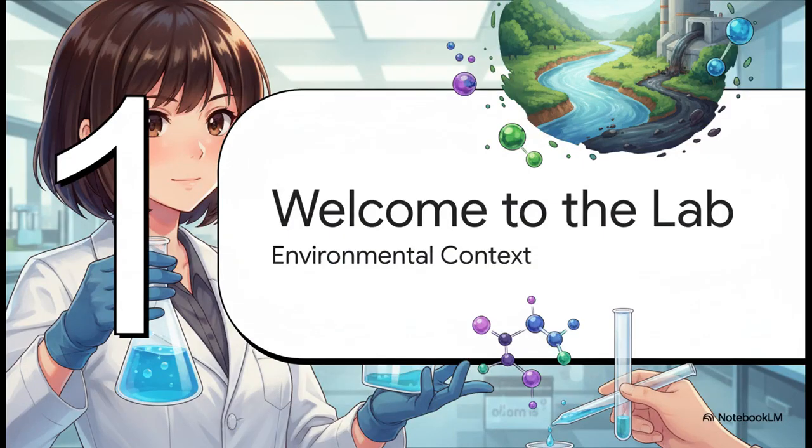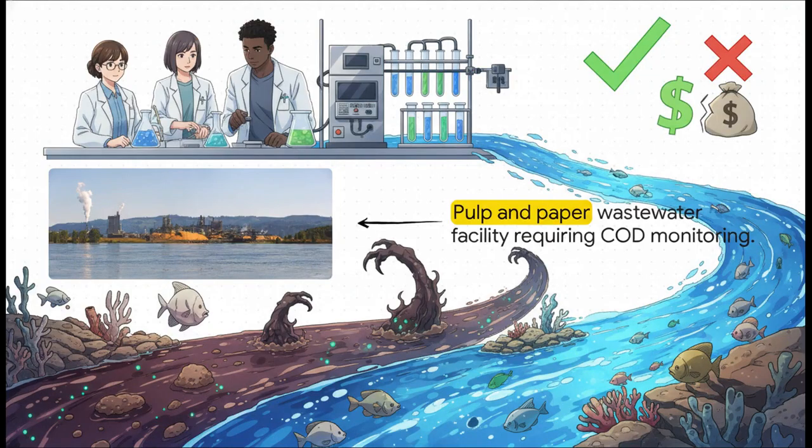Welcome to Dr. Kim Laboratory, setting the macro-environmental stage. Take a look at a massive pulp and paper facility like this one. Water-intensive industries generate enormous pollution loads, and their wastewater is just packed with suspended solids and dissolved organic matter. Our COD analysis is the exact tool they use every single day to monitor this effluent. It allows these plants to treat their water properly before it's discharged, completely preventing this industrial waste from destroying aquatic ecosystems, and, of course, saving the company from massive regulatory fines.